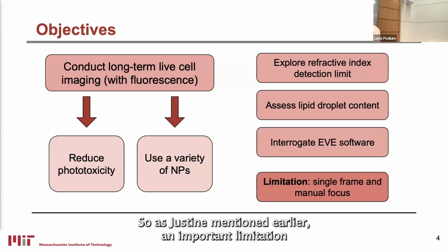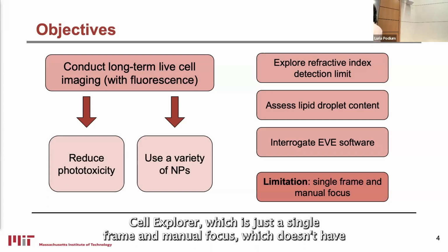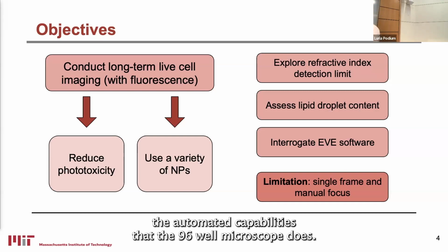So as Justine mentioned earlier, an important limitation is that we were using the 3D benchtop cell explorer, which is just a single frame in manual focus, which doesn't have the automated capabilities that the 96-well microscope does.